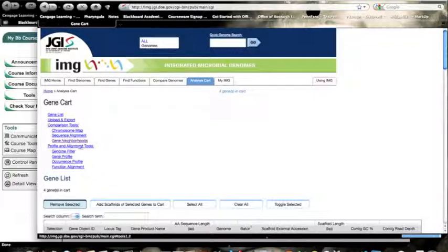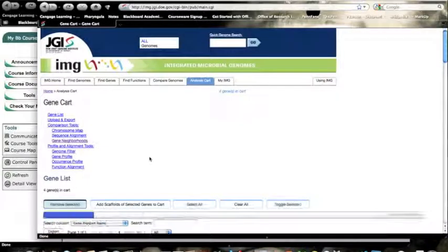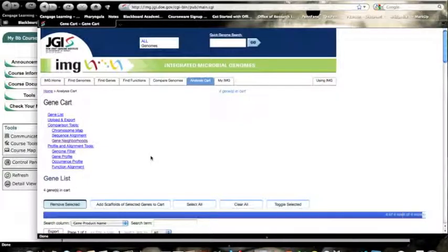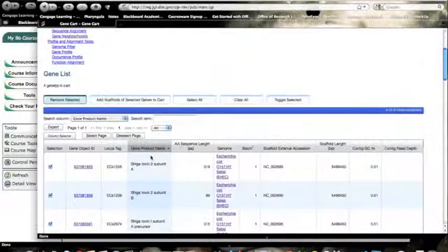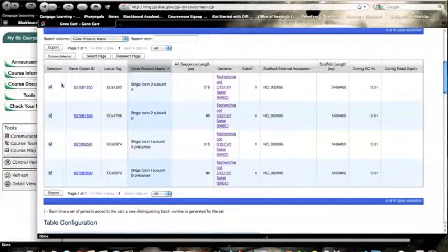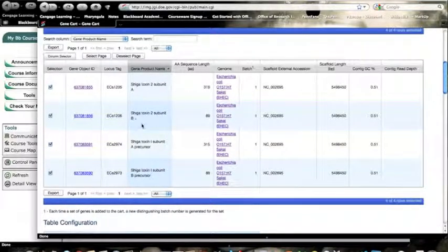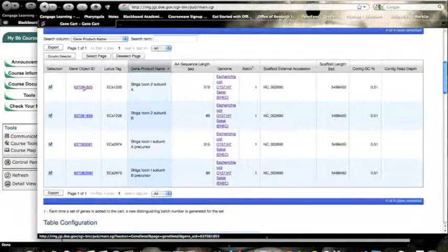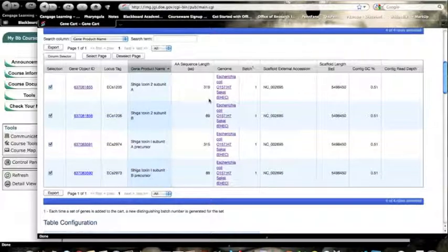And then you are immediately sent to an analysis cart where you could look at certain characteristics. You could look at the gene neighborhoods, which you see I've already done. So there we see it. There's our different candidate genes. We've selected them all. We're in the tools section.